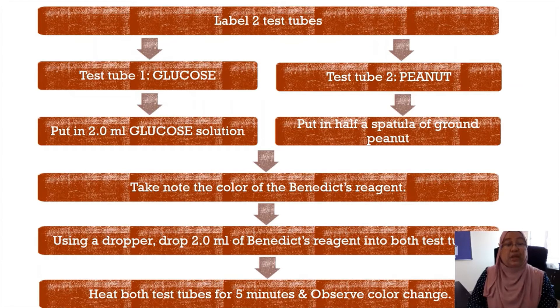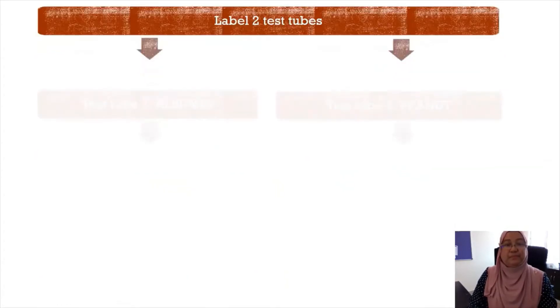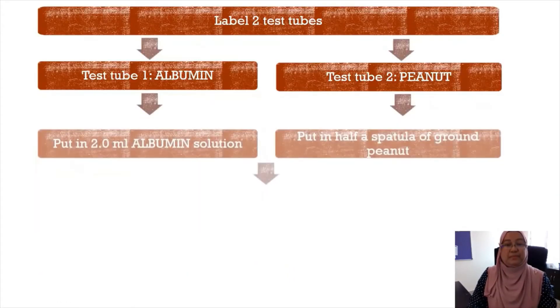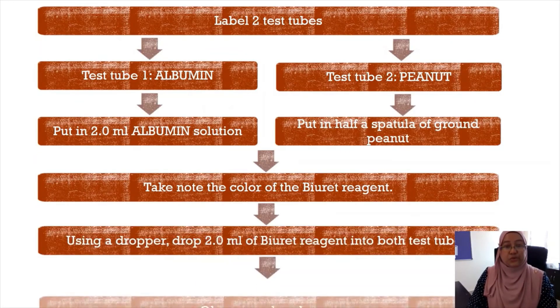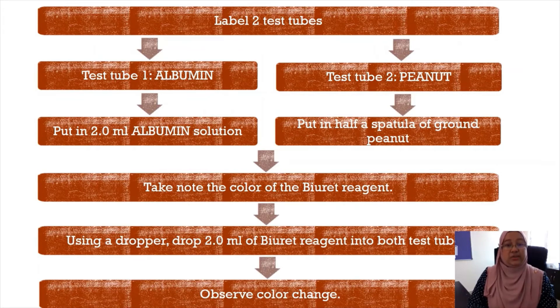Using a dropper, add 2 ml of Benedict's reagent into both test tubes. Heat both test tubes for 5 minutes and observe any color changes. This next procedure is carried out to determine the presence of protein.